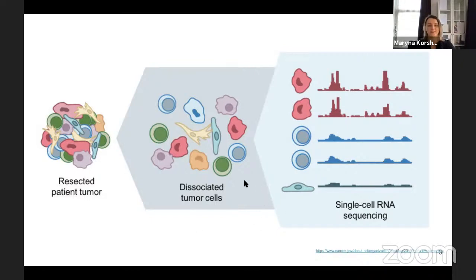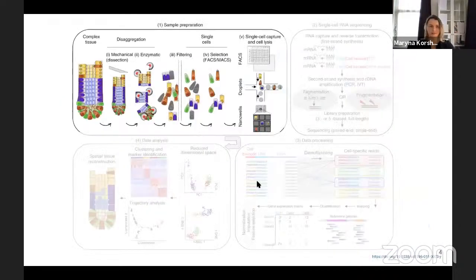Thanks, Marina. Yeah, so how to plan and what do we do to receive this awesome single cell data? It's one of the showcases where first of all you extract your tissue and try to make the cell suspension, to literally convert your solid tissue into a single cell state physically. So first of all, you do these wet lab procedures linked with further sorting or cell encapsulation in droplets. And then your main idea is to have your sample in the single cell state.